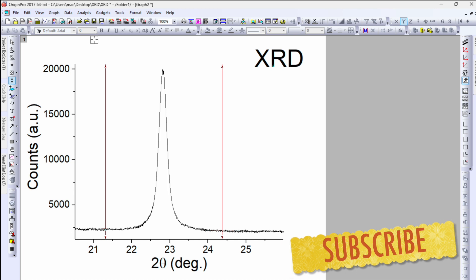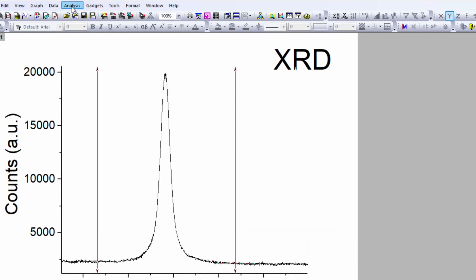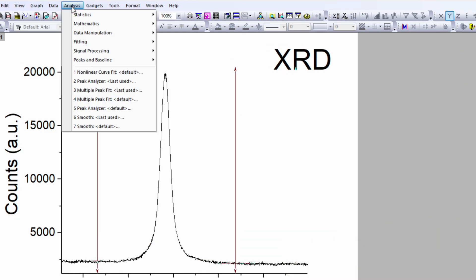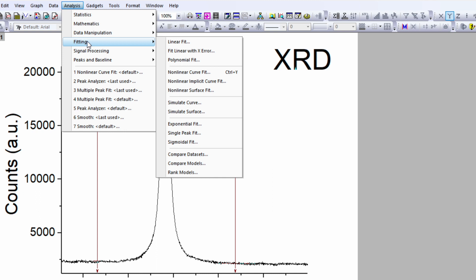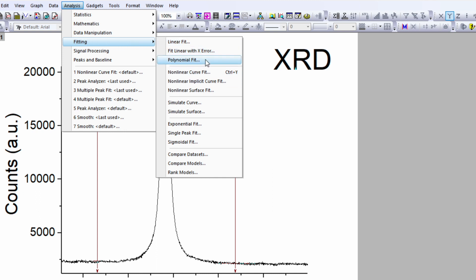Now go back and click on analysis. In the analysis menu, the fourth option is for fitting. On the right-hand side of fitting you will see the option for non-linear curve fit. The shortcut key is Ctrl+Y — click on that.